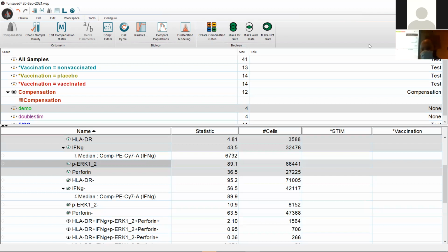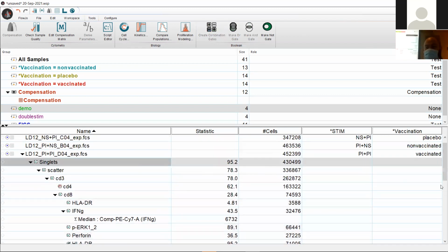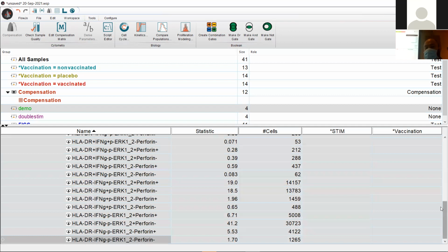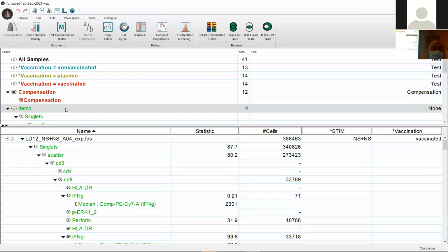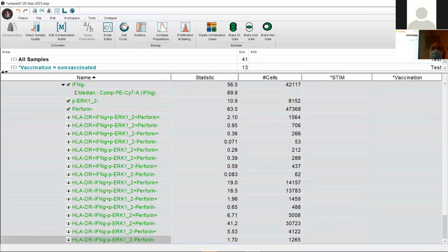All right, now that we did all this, it's a lot of work. So what I'm gonna do is go down here, select everything. And in FlowJo, we wanna save you time. So click, drag, and drop onto your group. And the analysis for all of your group is done, as you can see. So you just did an advanced conventional analysis. I started like 5 minutes ago with this, and you're done. So you don't really need to invest a lot of time in analyses.